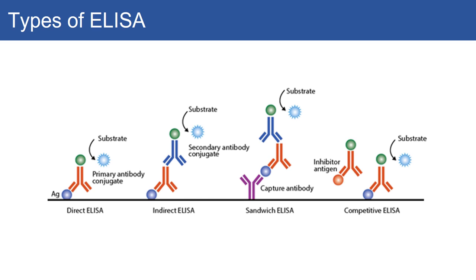A sandwich is what we described in the first video, and you can have a competitive ELISA, which is what I do mainly for a living, where you can have an antibody that binds the same epitope, meaning on the target, it binds on the same spot. Proteins commonly bind, or antibodies commonly bind in the same spot. So competitive, you take 2 antibodies and see if they block each other. So those are the types of ELISAs. There's 4 general types, although there's very different variations, and you can find all kinds of people who will tell you different things about ELISAs.